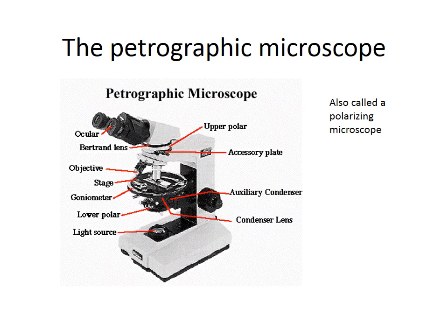You've already seen some of the features of the microscope, and I went over them briefly yesterday. To study anisotropic minerals, you need to become familiar with some of these additional tools. So the two polarizers, the rotating stage, the condenser lens or lenses, and the Bertrand lens. Today we're mostly going to focus on the function that the polarizers serve, and on Thursday we'll talk about the condenser and the Bertrand lens and how they're used.